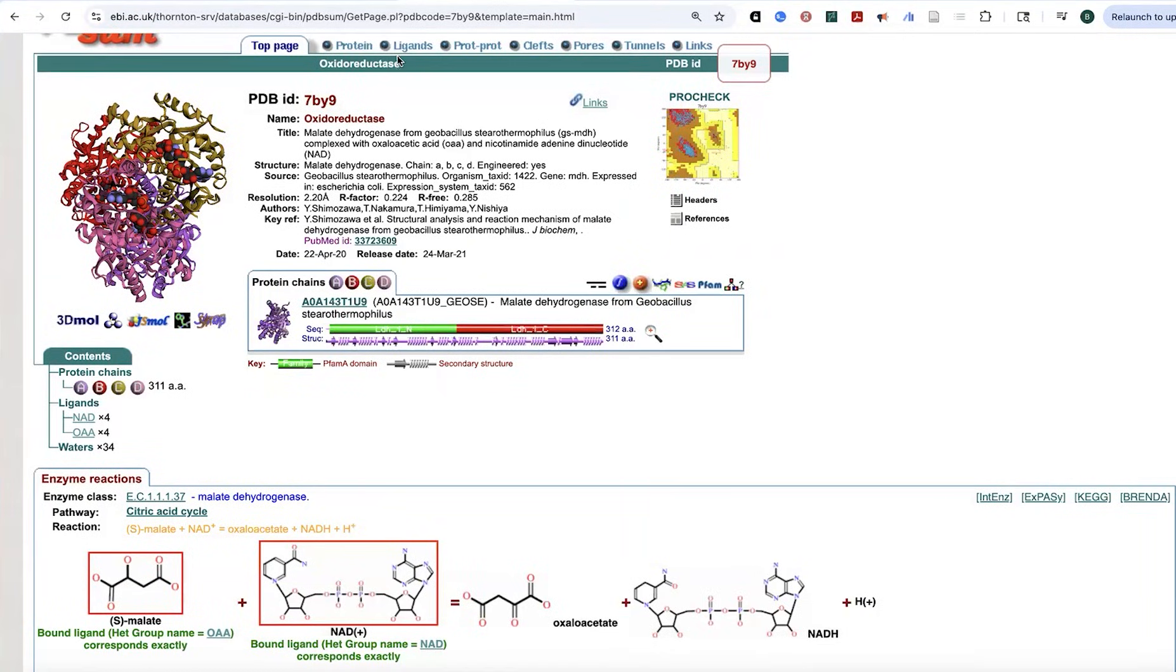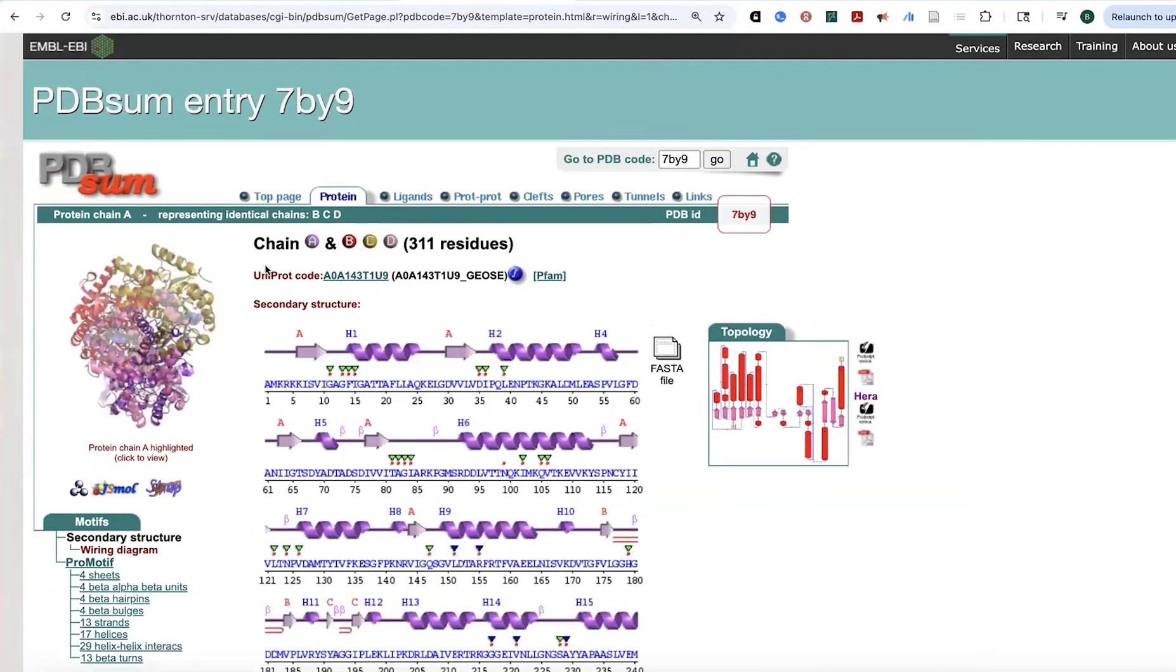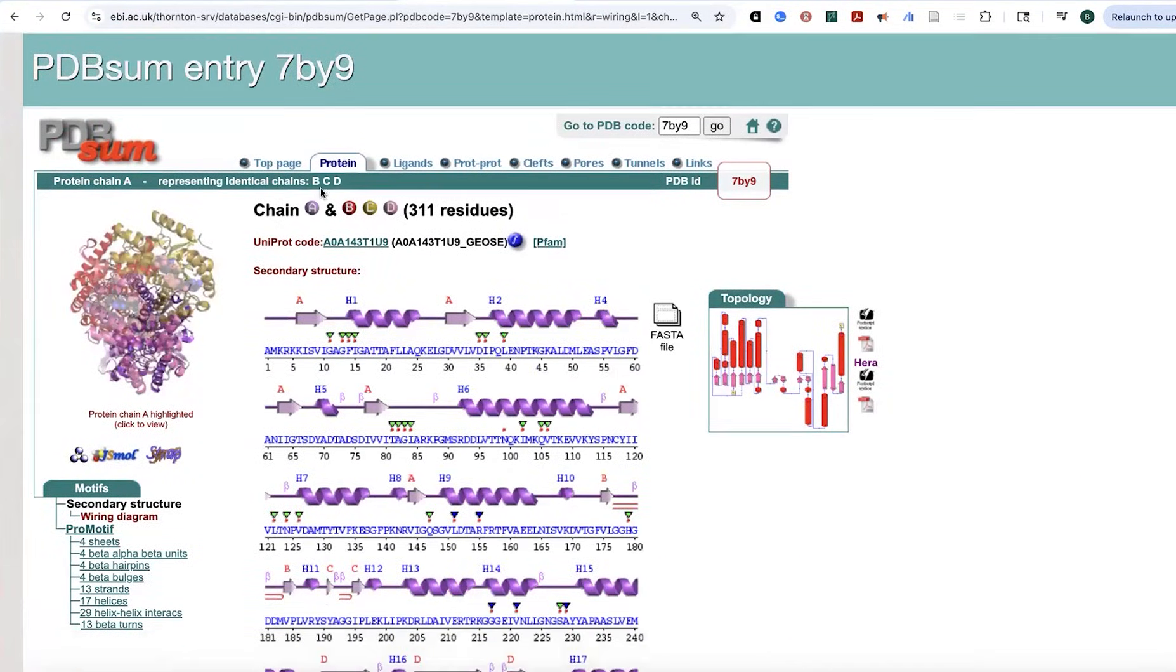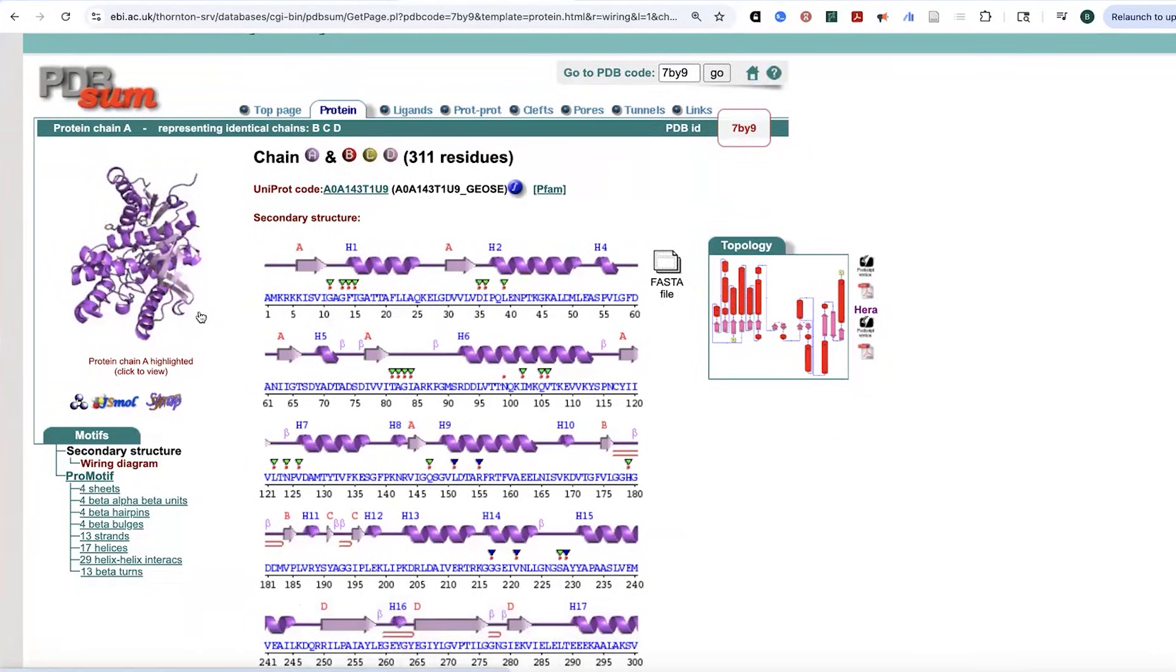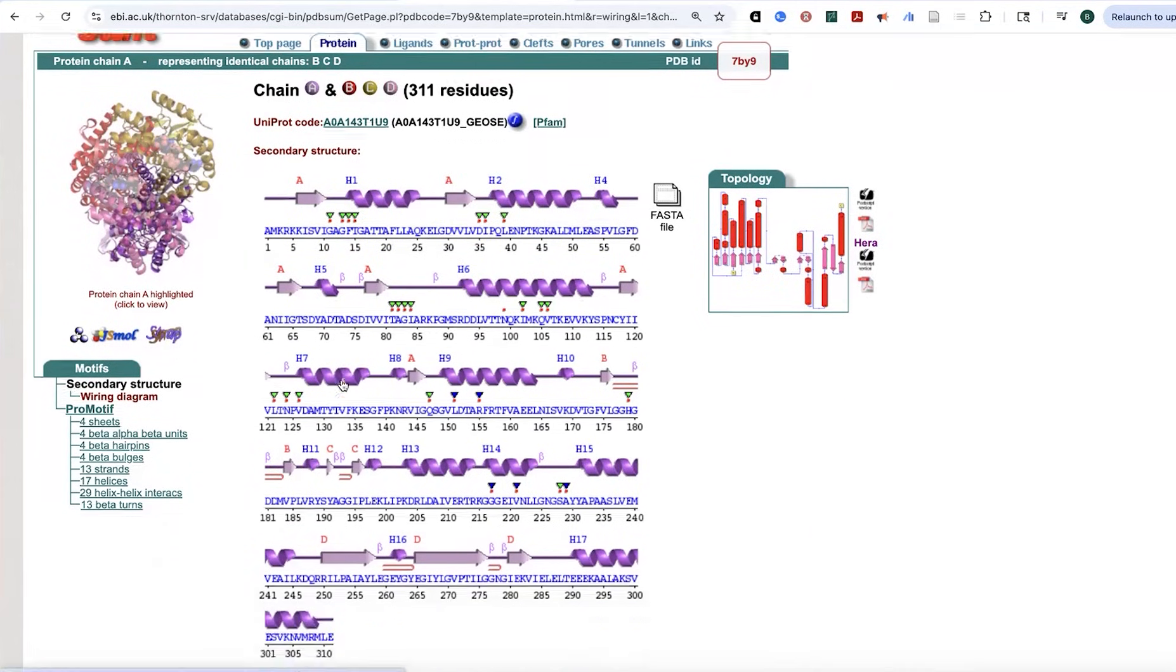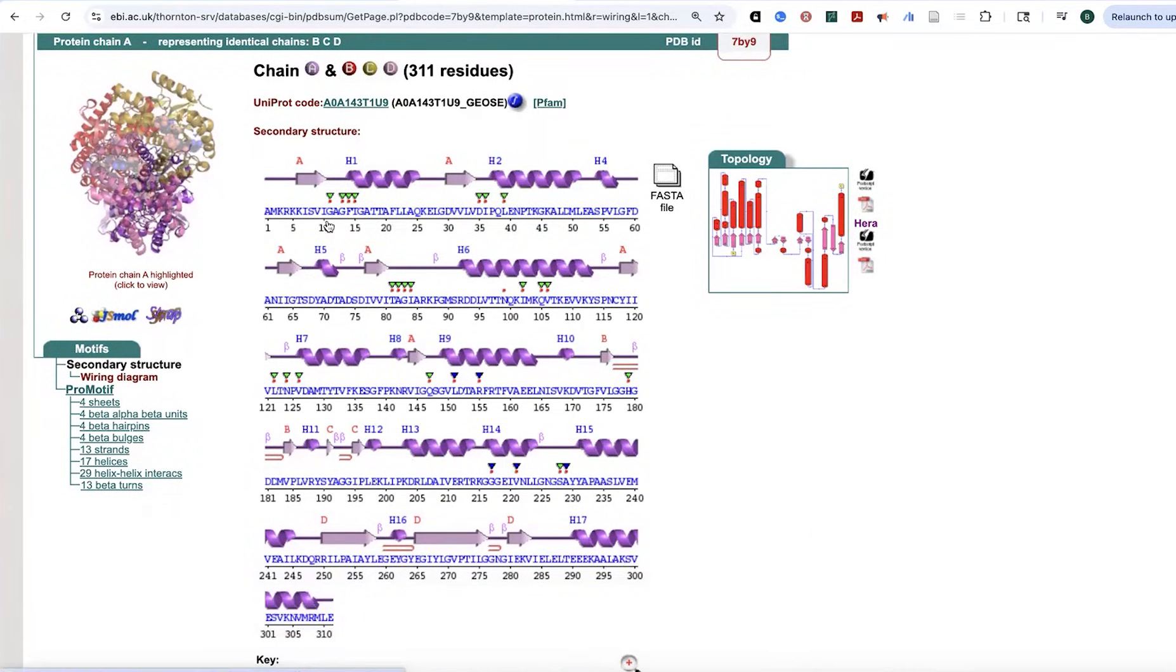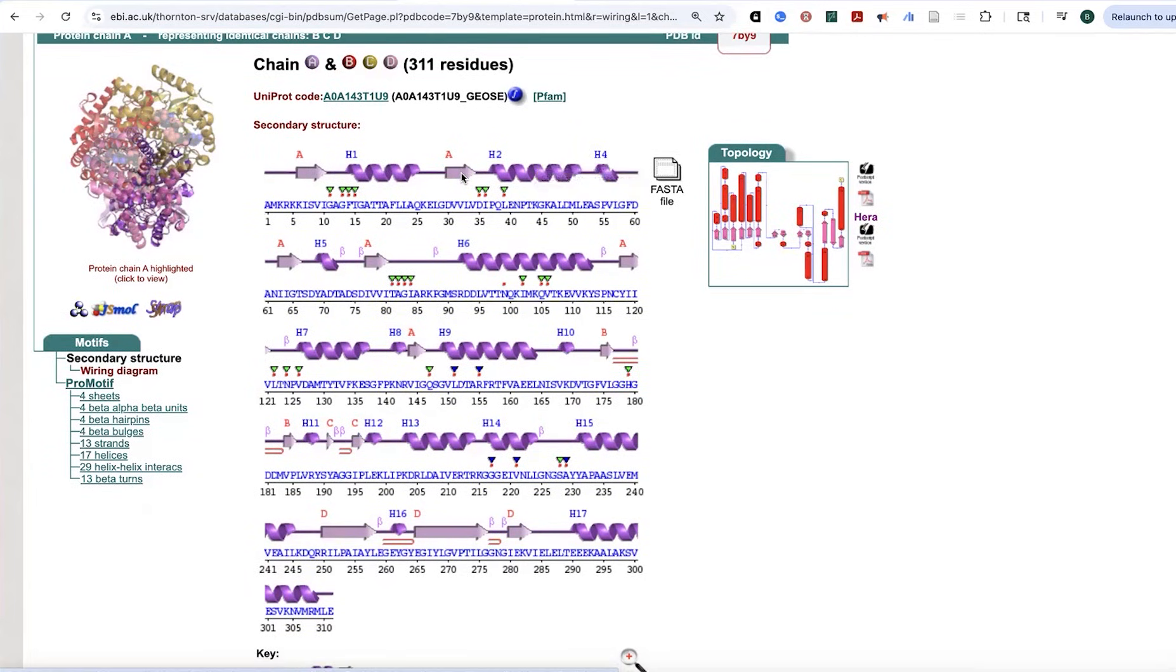That's cool, but we can get an even cooler view if we go over to protein. So because these chains are all identical, it's just showing me one of them. But it's telling me that it's basically the same as all of these. What I see now is I see the actual sequence. And then over the sequence, I see that nomenclature that we saw before where we have the helices and we have the arrows.